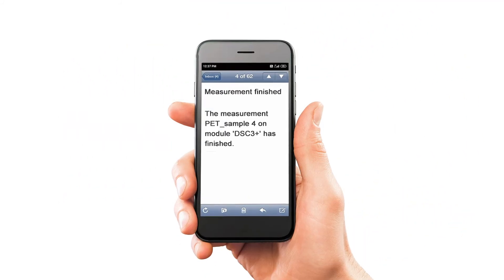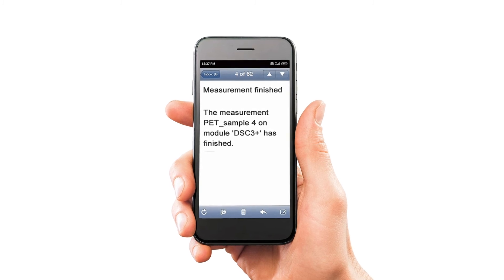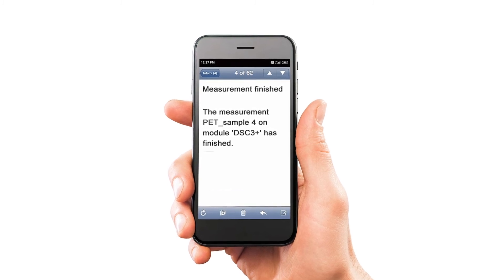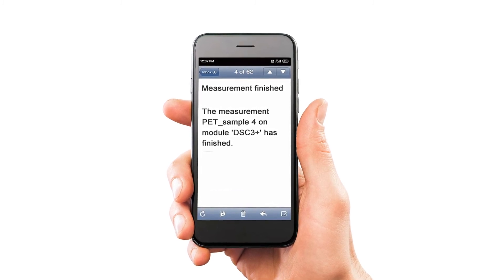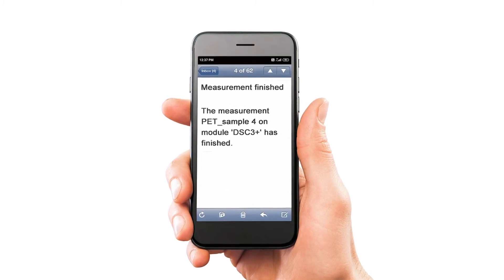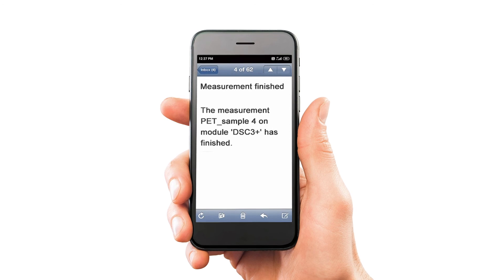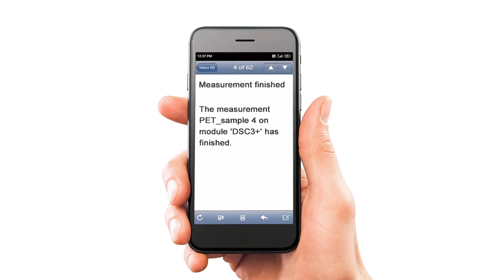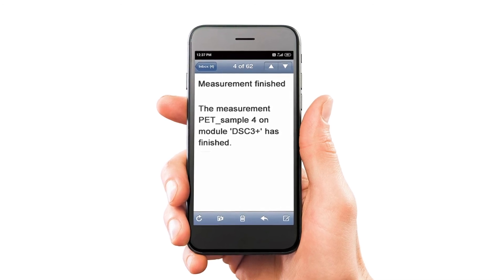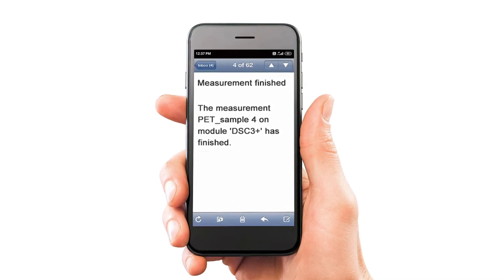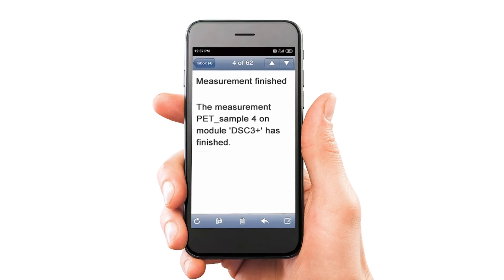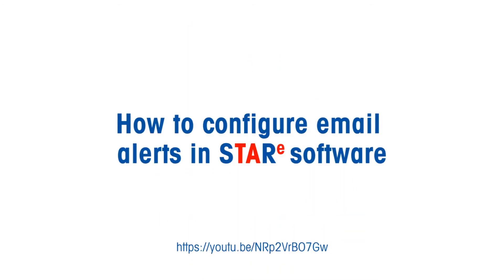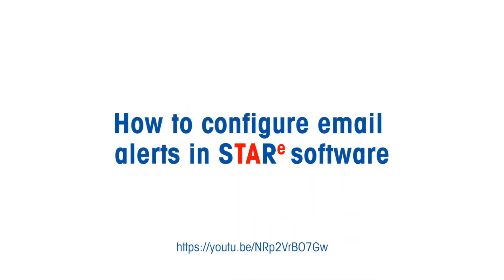In addition, Mettler Toledo's STAR-E software enables users to opt into email notifications regarding the status of experiments, automatic evaluations, and database backups. This feature is explained in a separate how-to video.